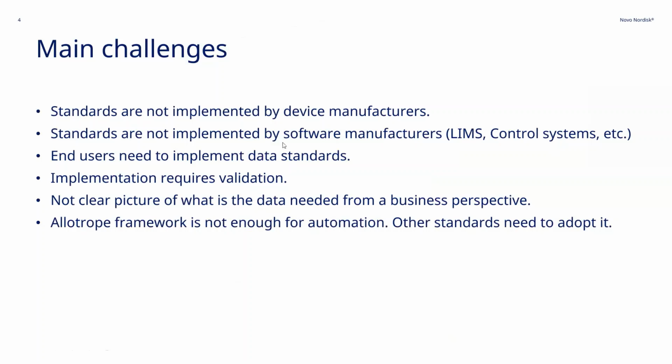Our main challenges are the same old boring ones: none of the devices has any standard when it comes to data or control.